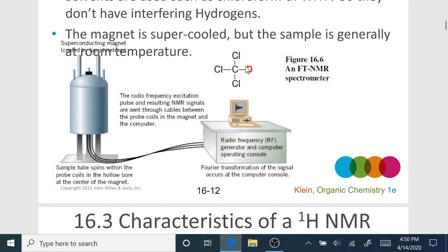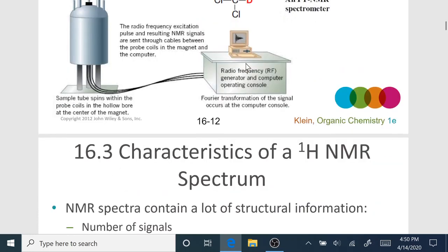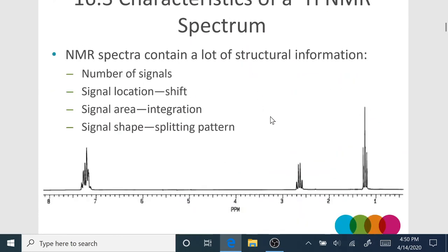So we're receiving that information as they relax. So generally we use deuterated solvents, so we have a deuterium instead of a hydrogen on our solvents in order to not interfere with the signal. Okay. So also we'll talk about in a minute, we use an internal standard called TMS that allows us to set our zero mark or calibrate our sample against the spectrum.